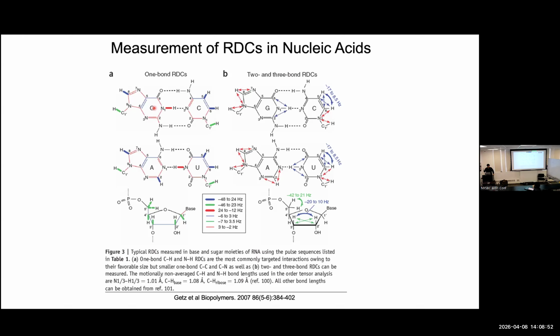It's actually the dipole. For NHs, unless you get to 800 megahertz or a gigahertz, the CSA is field dependent, and for amides in proteins, at a gigahertz, the CSA and the dipole equal each other. But when you're at lower fields, the dipole is dominating. The CSA is small. So generally speaking, that's a rule of thumb. Now aromatic carbons, their CSAs are larger. So at 800, it's roughly 50-50 CSA and dipole.